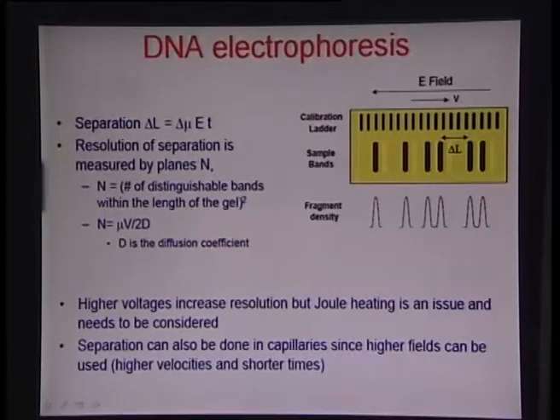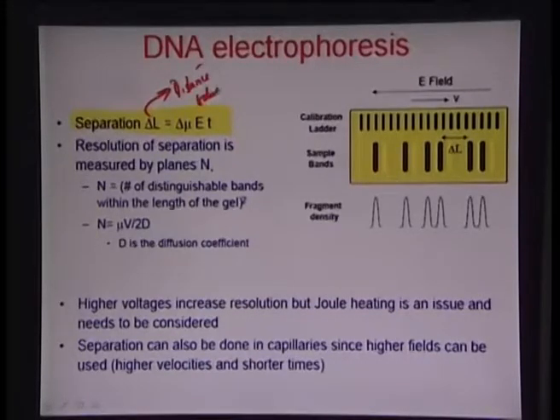You see the separation distance delta L between two different fragments with various mobilities as you are moving through a gel matrix. So this is the distance between two strands of different lengths.